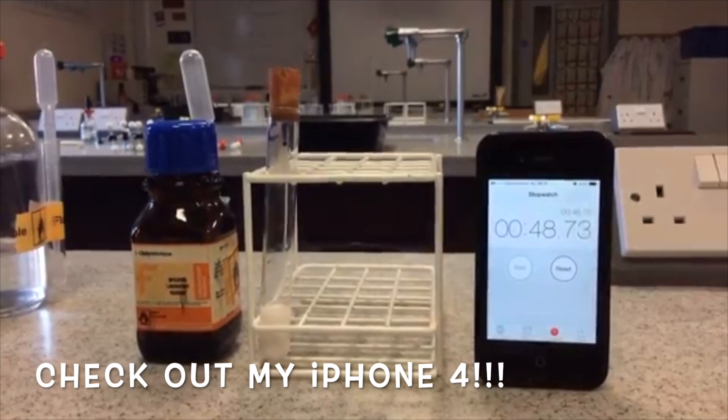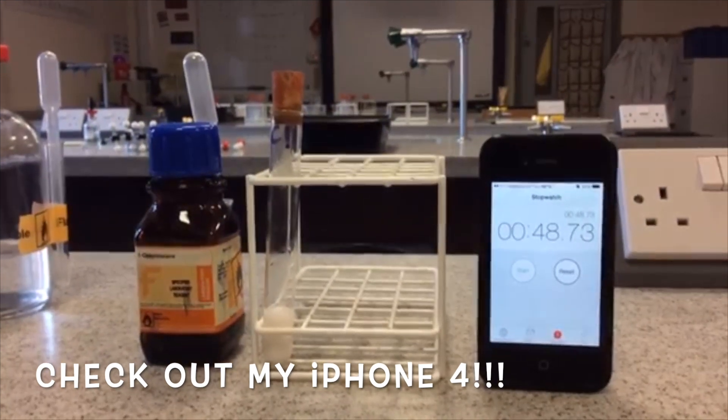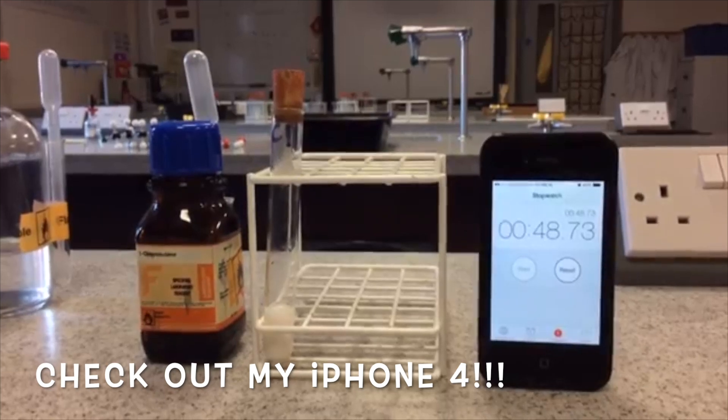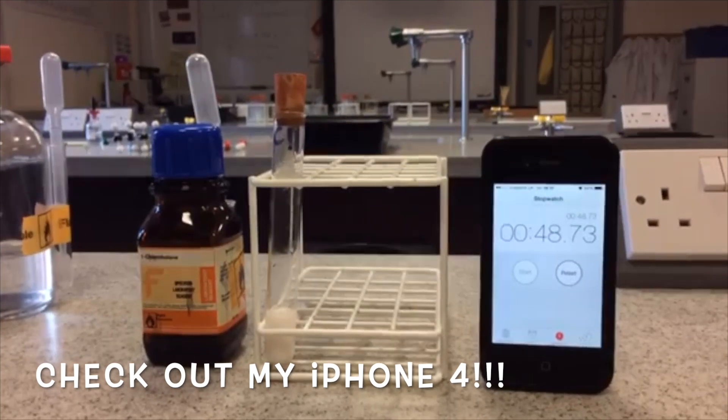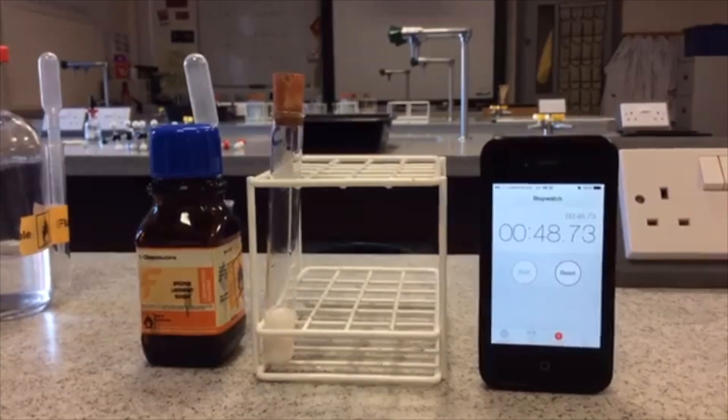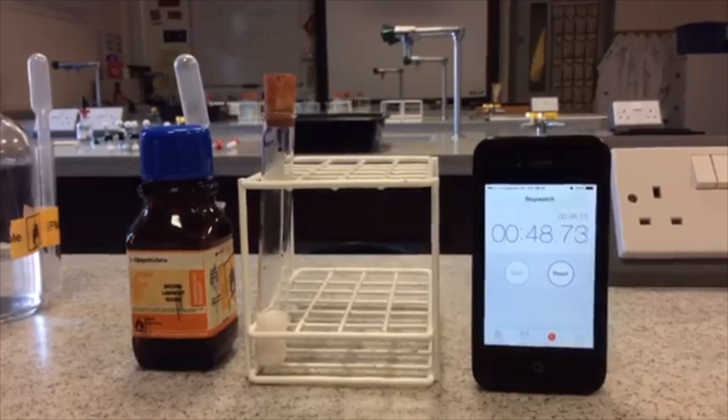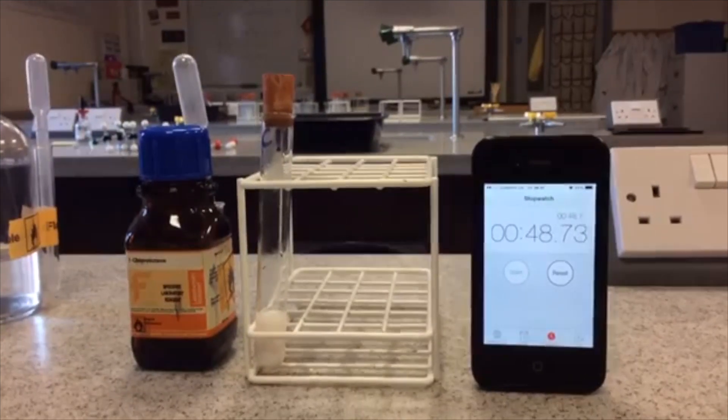There we have the white precipitate of silver chloride, formed from the hydrolysis of 1-chlorobutane in the presence of the silver nitrate solution. You can see from the stopwatch there that's taken 48.73 seconds.